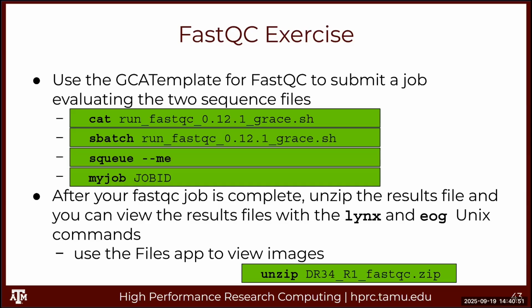Okay, now do sbatch space, RU and hit tab. Enter. Okay, now it says submit the job. You can see there's a job ID. Now type in the letter Q and hit enter. So see, it shows your job is running.